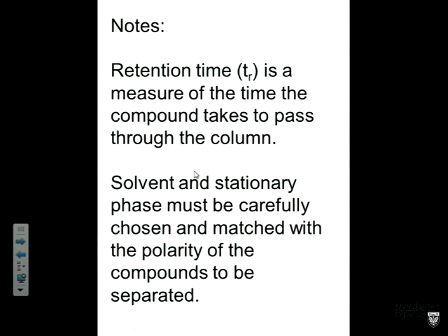If your compounds are colored, the detector is your eye. You can actually see the bands of different color traveling down the column. And so then you can just use visual detection.